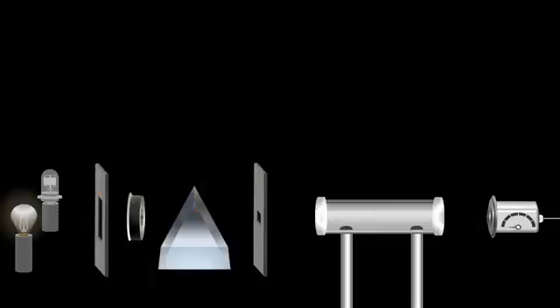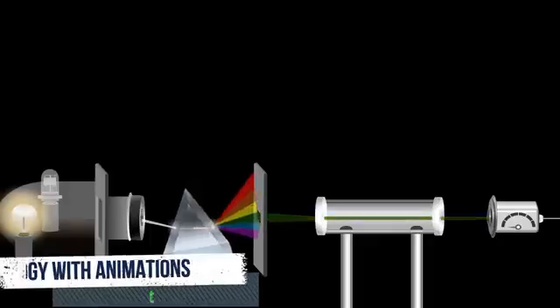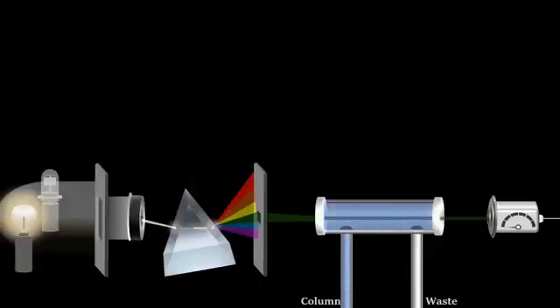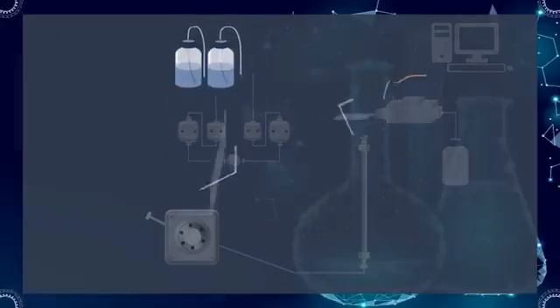Light from the lamp is shone onto the prism and dispersed according to wavelength. When the measurement is performed with a specific wavelength, the angle of the prism is adjusted so that the light of this wavelength can shine on the flow cell. As the compounds elute from the column, they enter the flow cell, where the bonding and non-bonding electrons of these compounds can absorb energy in the form of ultraviolet or visible light. The manner in which the final data is displayed is based on the computer and software.